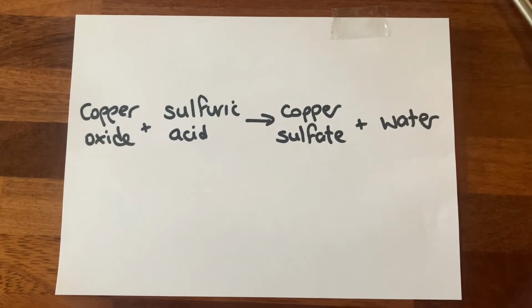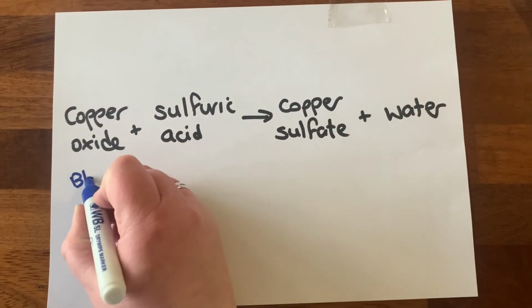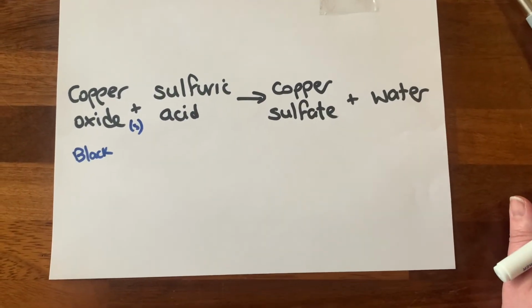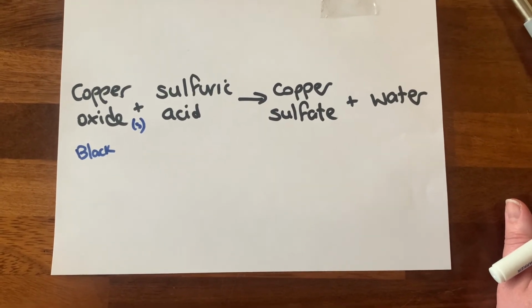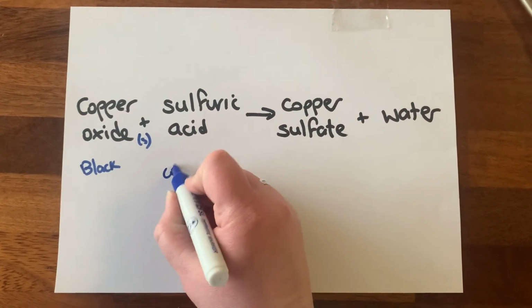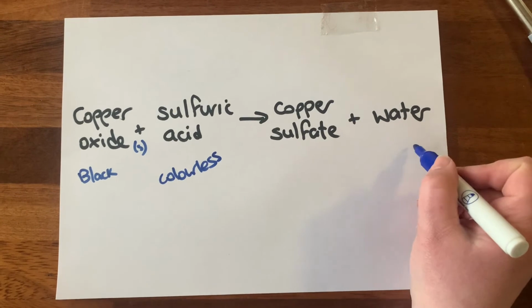So this is the word equation for the reaction we've just looked at. We had copper oxide, which was a black powder. It was a solid, it was insoluble in water. It is known as a base because it will neutralize the acid, but it's not soluble in water. We had sulfuric acid, which was colourless, and they both reacted together and they formed copper sulfate plus water.